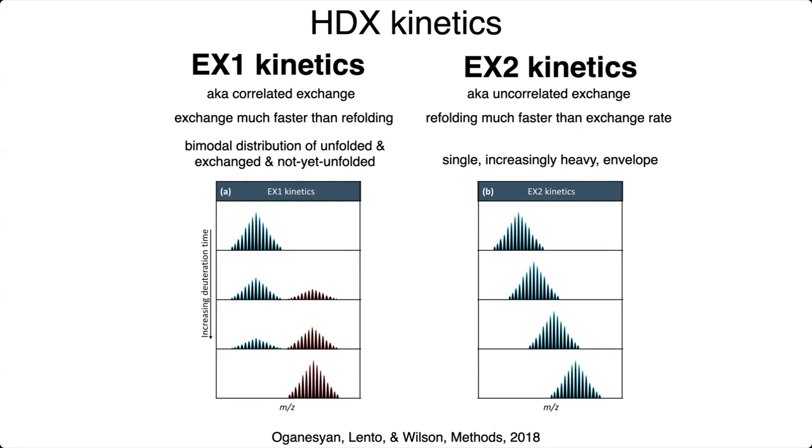So you can think about a protein opening and closing and opening and closing and opening and closing. And remember, these can be dramatic openings and closings, or they can be just little localized breaks in the protein structure. And again, breaks not in terms of breaking the backbone, but just breaking some of those interactions, making it so that the deuterium can exchange.